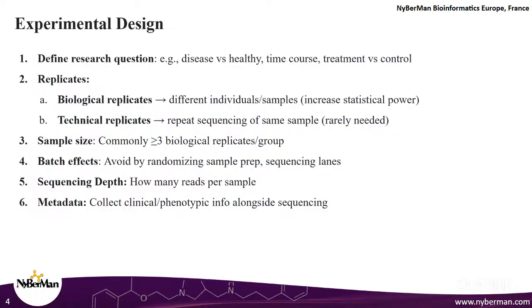We will understand how all of this is done, of course, but on the wet lab end, on the part of the experimenter, the person who actually prepares the samples, it is very important to avoid batch effects by randomizing sample prep, so that your conditions are not exactly differentiated by the batches. In batch 1, randomly run 3 out of the 10 samples, that is fine, but you as a user should not know what these samples are. That is how you truly reduce batch effects from your end.